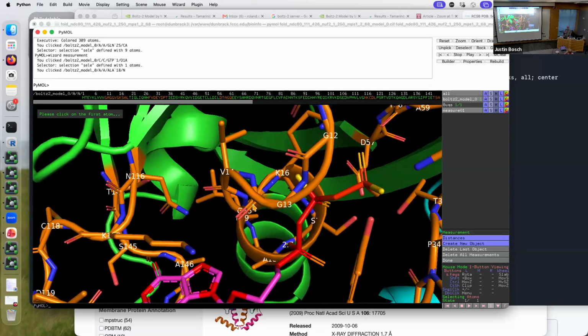I have to say this to my students all the time because they will send me huge amounts of data. I'm like, well, did you look at the models in PyMOL? No. Or, I looked at the models in PyMOL, and those proteins are not interacting correctly, or it's just spaghetti, or it isn't saying what you're measuring. You measure the distance between this and this. I looked at it in the structure, and that's not the distance at all. You have a bug somewhere. Totally fine, totally reasonable, happens all the time.